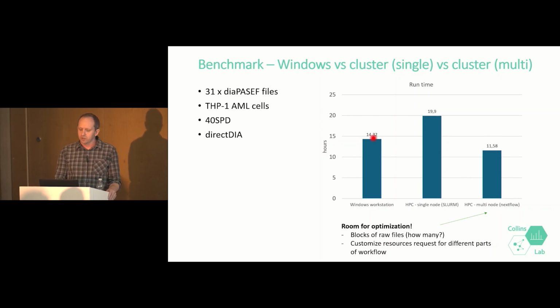And you can see that the Windows one actually goes pretty fast. It's pretty well optimized, with this 20-core i9 processor. The HPC on the single node, even though it's 64 cores, actually takes a bit longer. These are slower. It's a slower base rate processor, 3.7 gigahertz versus 2, so that explains some of that, but maybe there are also some bottlenecks in terms of file I/O on the cluster that need to be sorted out. We haven't worried about this too much.